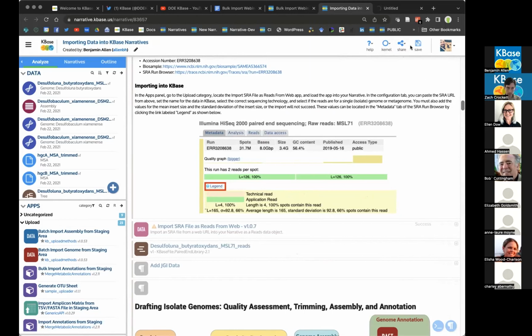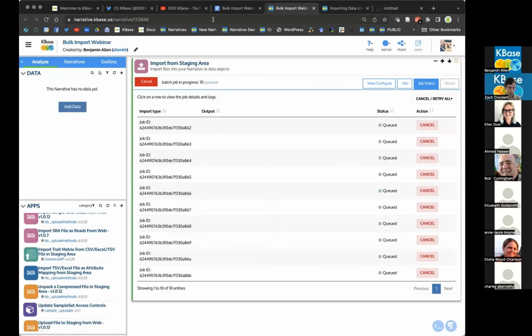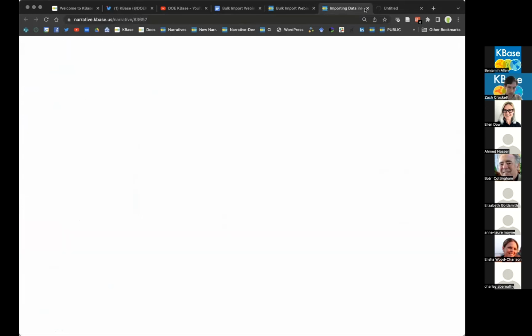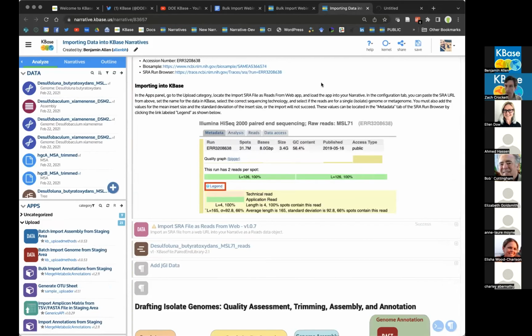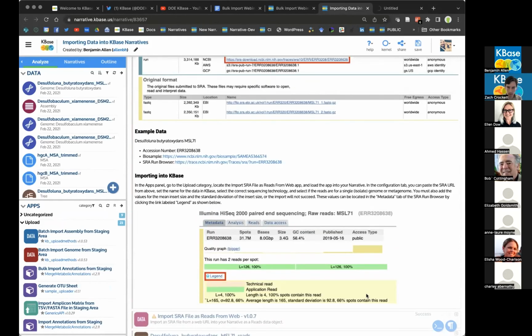So all right, I'm going to see if this is working again. Zach, is your KBase working? I assume you're probably testing it right now. It was when I checked earlier in CI. Okay. Let me pause my screen share, and I'm going to hand it over to you if you're ready, just to see if I can address what's happening on my side. Is that okay? It seems to be loading on my end, Ben. Okay. Well, I'm going to hand it to you, Zach. Okay.